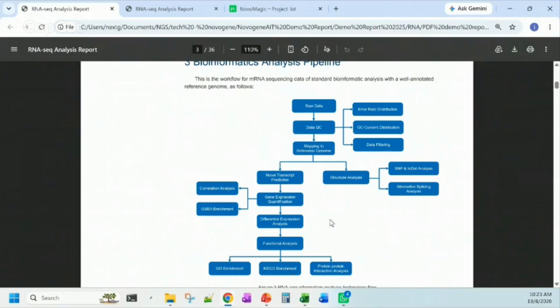In addition to that, because we have the sequence data, it makes sense for us to also study the structural profiles of them.